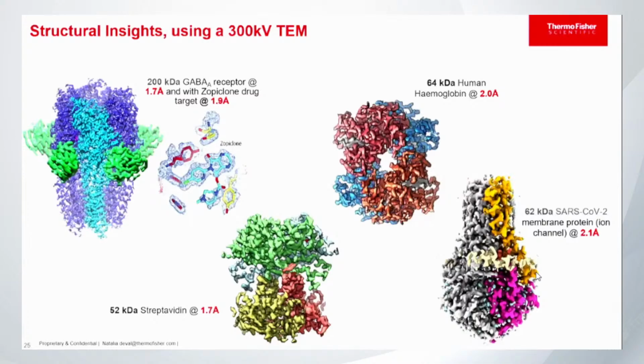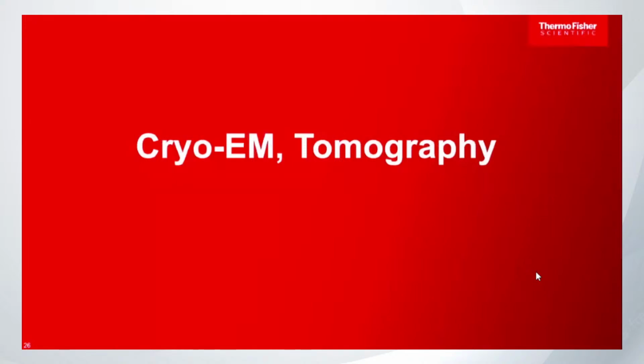Okay, so cryo-tomo. This is very cool. I love it, seriously, because it's visualizing the protein like you want, in your cell. And that's the beauty of this, because sometimes you have surprises. Sometimes you are working with an isolated protein and you are convinced it's a monomer, and after you go to the cell or the tissue, it's like, oh crap, it's a dimer.